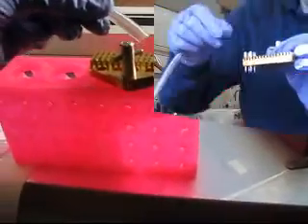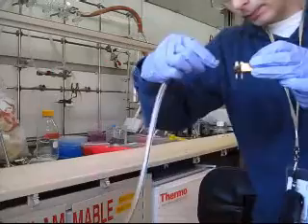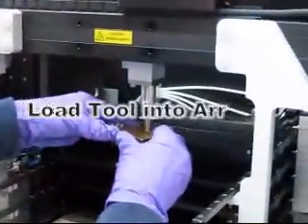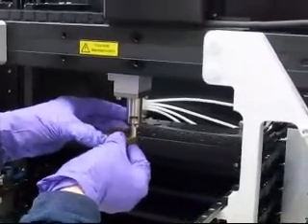Next, dry the pins and tool under a stream of compressed gas. This step is important to remove any debris or moisture that can lead to pin sticking. Finally, the tool is ready for loading into the arrayer.